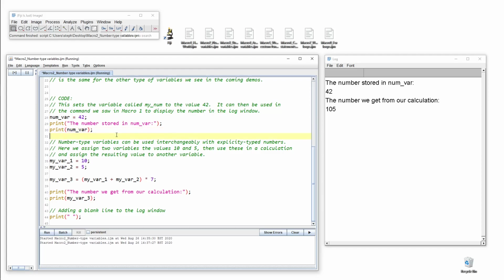And that, you know, it looks fine, it's pretty enough, but the main benefit here is that as you're typing, you can straight away see whether what you're doing is working. Like if I'd mistyped this statement here, I know that that function should be coming up in that yellowy brown colour. So if it comes up in black, it's an indication that ImageJ isn't recognising that as a function. And indeed, when I get rid of that wrong character, it goes back to that. Same with the strings here. If that, for example, didn't have the end quotation mark, it again goes a funny colour, indicating that it's not behaving correctly.